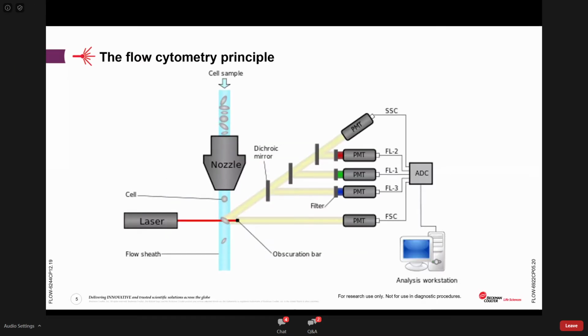The laser of a specific wavelength excites a fluorophore on a cell to emit a fluorescent signal, and this signal is recorded by detectors. In the ideal experiment, each detector would record light from one fluorophore. So, for example, on a 13-color flow cytometer, we could interrogate the same cell for the presence of 13 different biomarkers, which potentially could all be colocalized on the same cell.